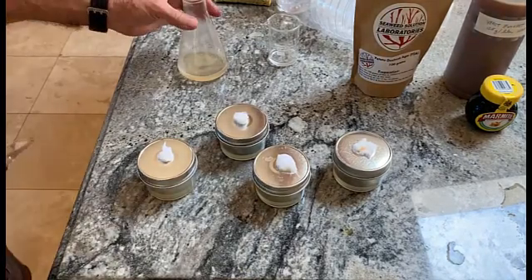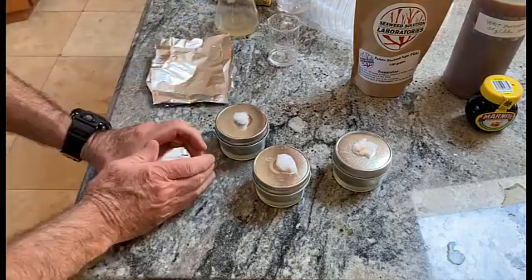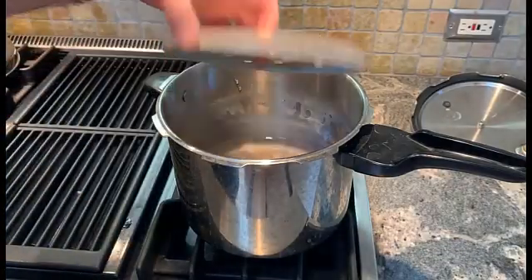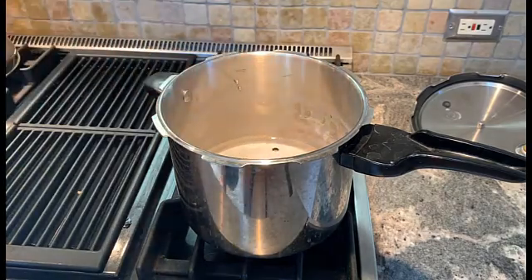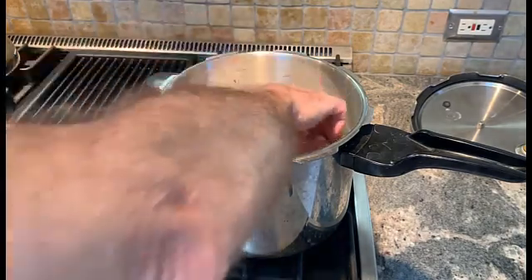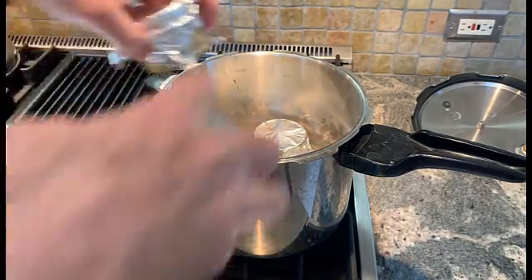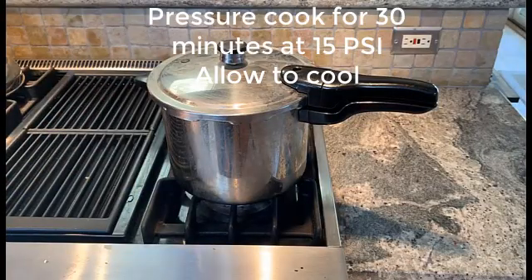The next step is to put some aluminum foil over the top so that water doesn't get in there during the sterilization process. This goes in the bottom to keep the jars elevated a little bit, and then we put the plates in the cooker and pressure cook for 30 minutes at 15 psi.